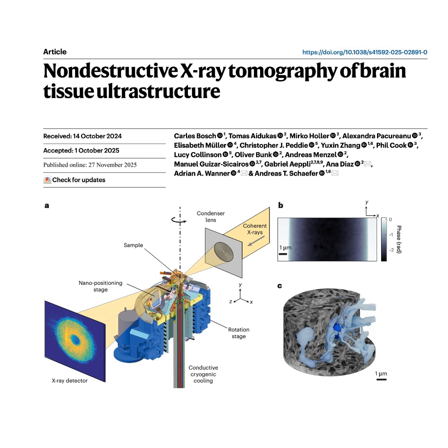First, they swapped out the normal plastic for TGPAP, a nuclear-grade resin with these aromatic rings for extreme radiation resilience. And second, they used the OMNY cryo stage to physically lock the sample down below 95 Kelvin. This let them blast the tissue with the huge X-ray doses needed for high resolution. But even with all that, a kind of ghost-in-the-machine issue remained.